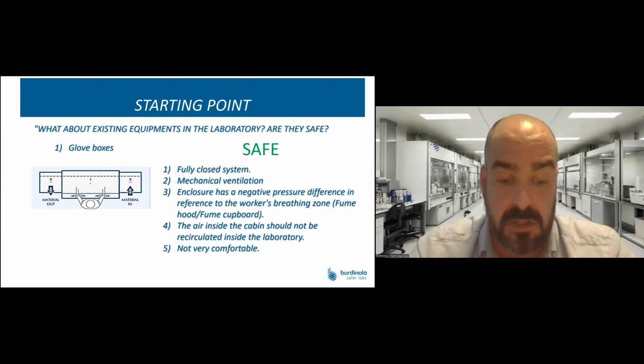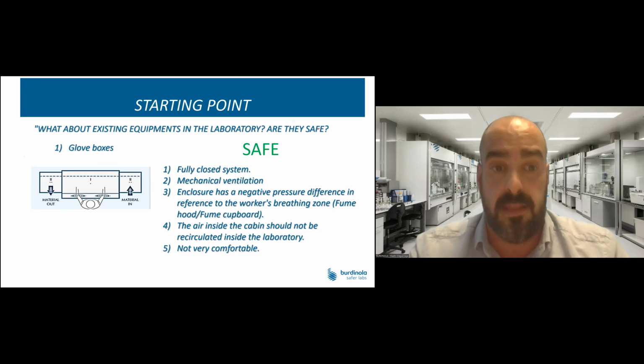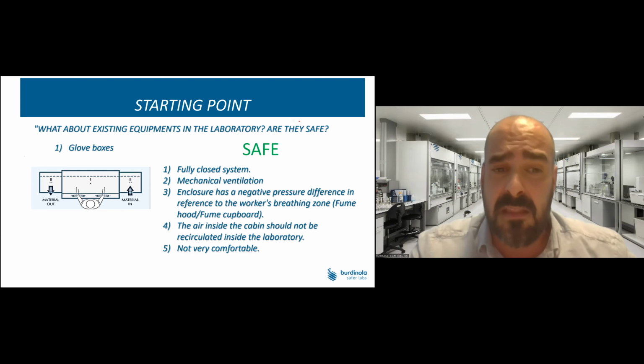it is based on a glove interface. There are some actions that are repeated in the laboratory process, such as dosage, weighing, and dissolutions, and all of them need to be done precisely, and gloves don't allow that. Okay, so this is safe equipment, but not very comfortable. Okay.